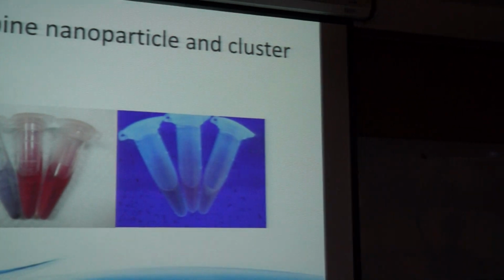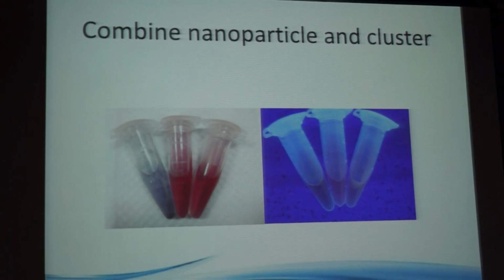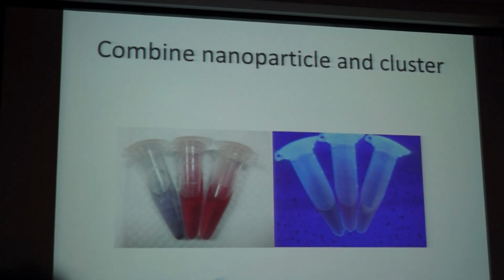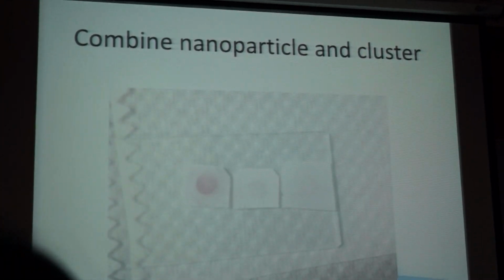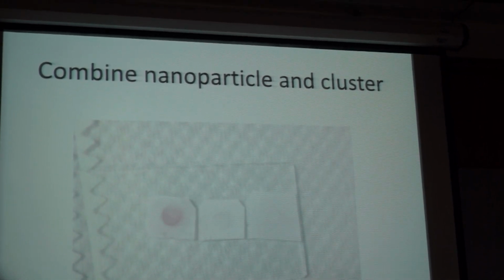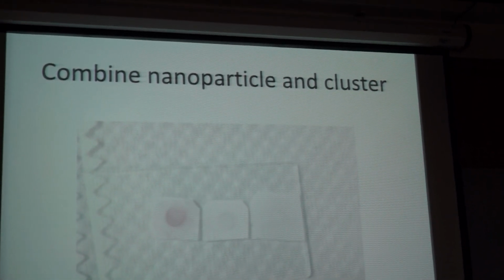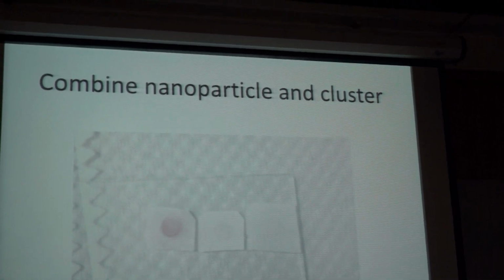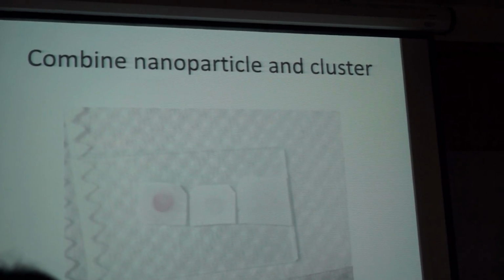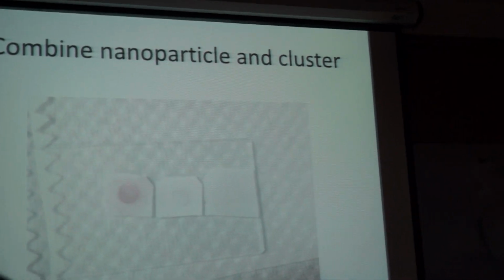And next step, we want to make sure our nanogold will only react with ketamine. So we did our last experiment again, and we found that the only paper that contains nanoparticle, antibody and ketamine will have a red spot in the middle of the paper, which means our experiment was finally a success.